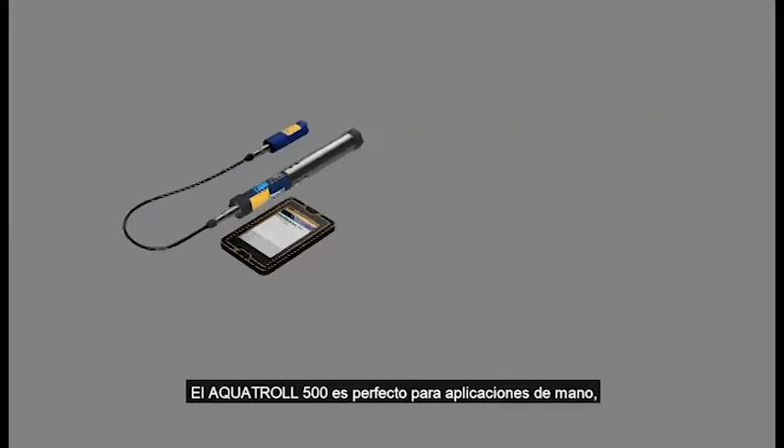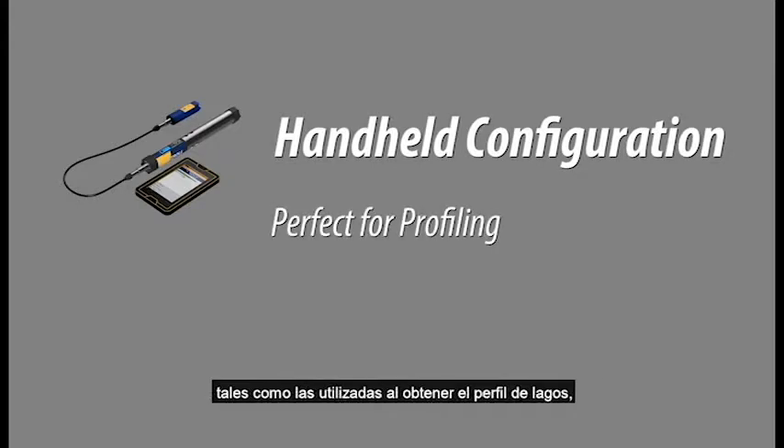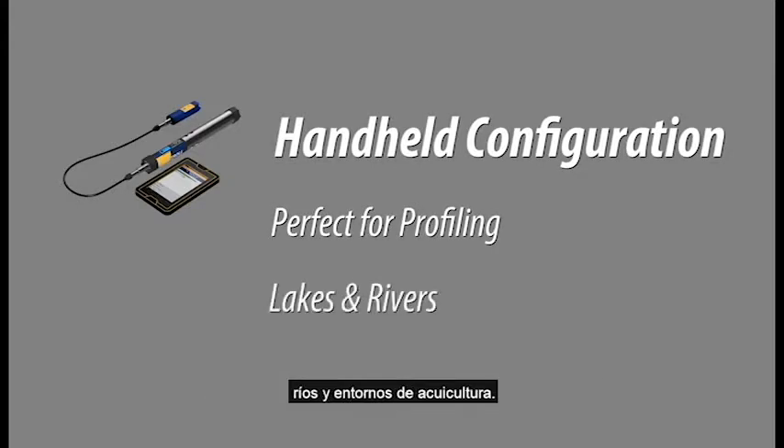The Aquatrol 500 is perfect for handheld applications, such as profiling in lakes, rivers, and aquaculture environments.